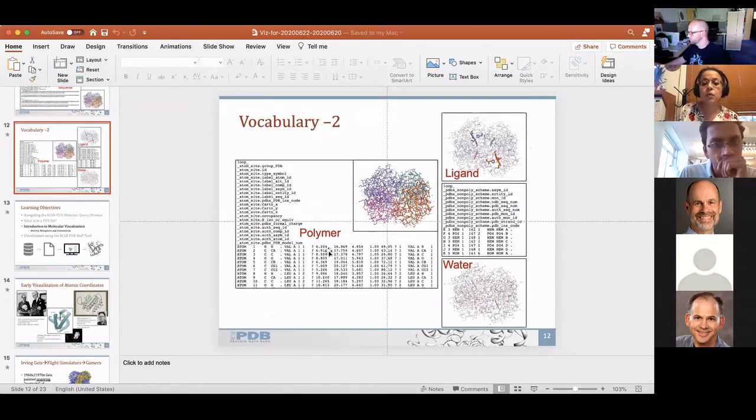So you're looking at this slide, right? I pulled up the mmCIF file for the main protease and was just looking at the raw file. Yes, each of the column headings is listed in a loop structure written right above the coordinate section, and so it's XYZ.